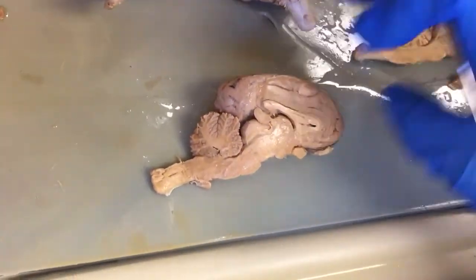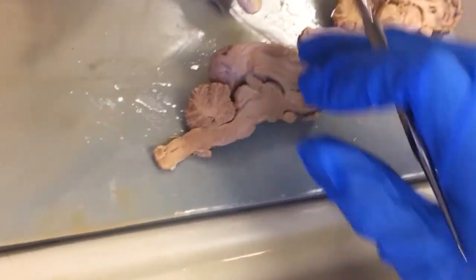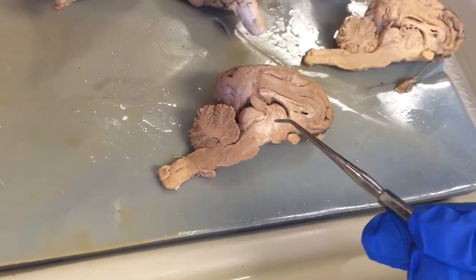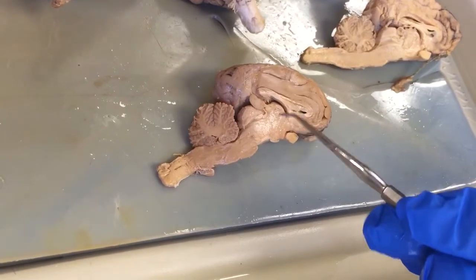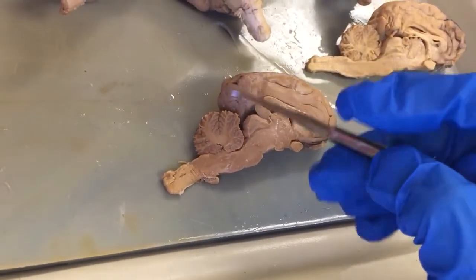Okay, so those are the main larger structures. So then I want to go through here and make sure that I get all the little cracks and crevices and small bumps that are also named, okay?